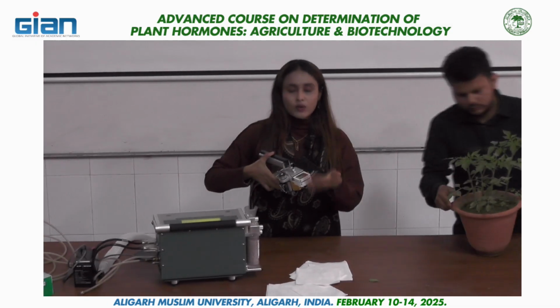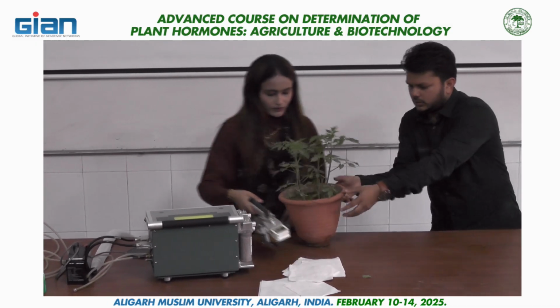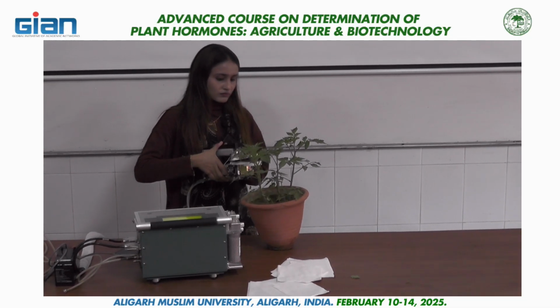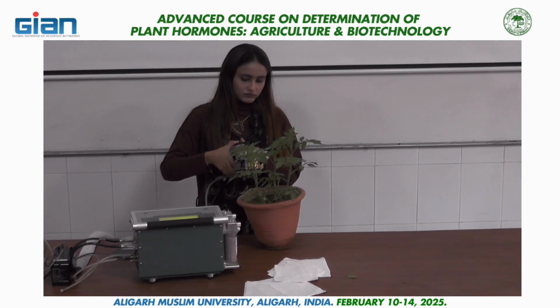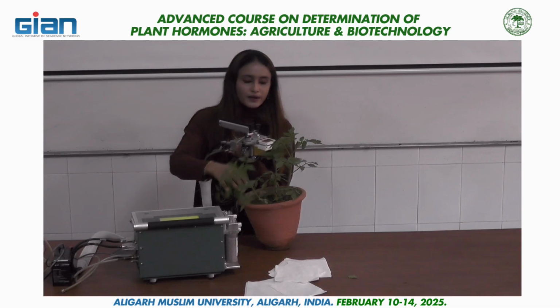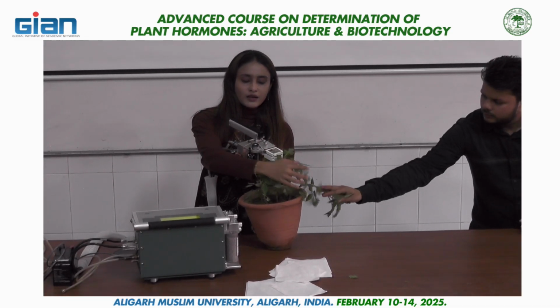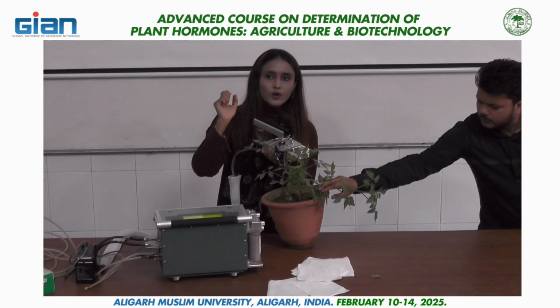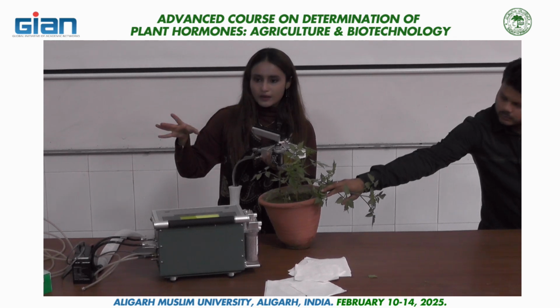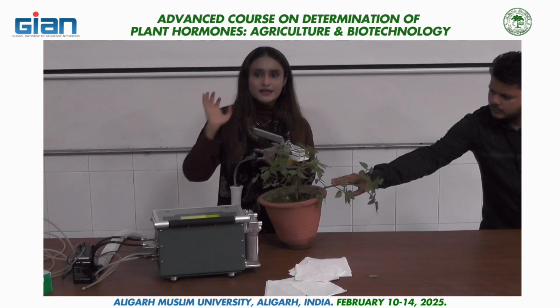We have to close it. Now this one is T3, hormone treated. Just make sure that the whole leaf sample is placed under this leaf chamber because inside it there are thermocouple sensors, okay? And there should be no dust particles or water in it, otherwise our reading will not come, and it can also damage our sensor.